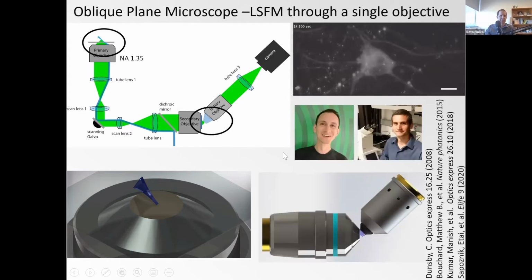This has changed a bit by Snouty, a specialized solid immersion lens, the brainchild of Andy York and Alfred Millett-Sicking at the Calico Institute, which, again, for brevity, I will not go too much over, but it sits here at this interface where the remote image is formed and then picked up with the tilted tertiary.